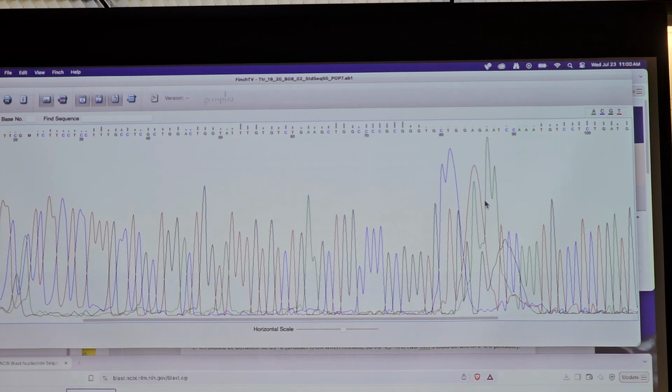Yeah, so if you have a mismatch between the forward and the reverse, and the mismatch is clearly because there was a little messy spot in your forward read and the reverse read gives it perfectly, then you're confident that the reverse read is the correct one. If it's in some other region where there's a discrepancy, then you're going to have to sequence again to try to resolve the problem. Because sometimes you get a problem when you run the sequence the first time, you run it again, you don't have the problem the second time.